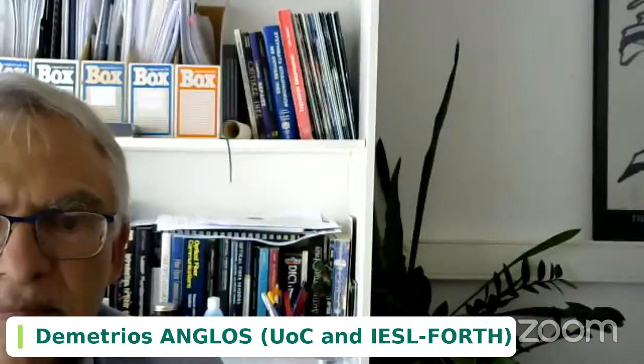Okay, so any question for our speaker? Okay, then if not, there is one question, Mary, there is one in the Q&A. Okay. So we have an attendee that asks if the compact CRDS spectrometer can be used for analyzing moisture permanently in various chambers.